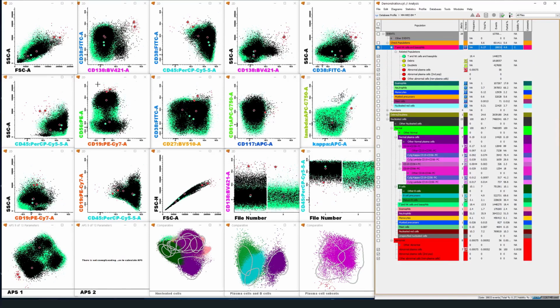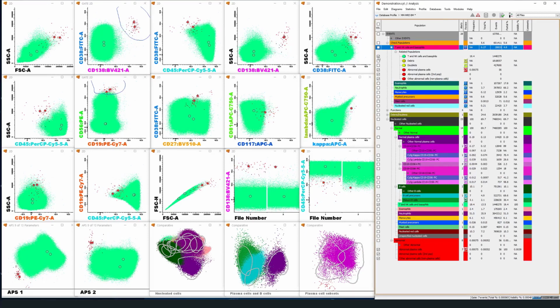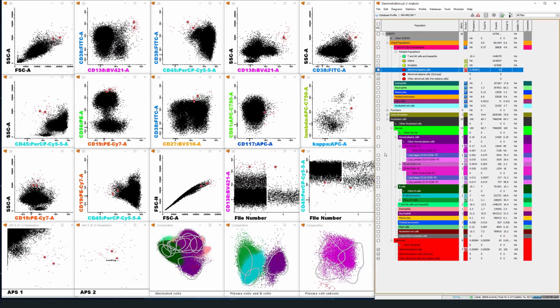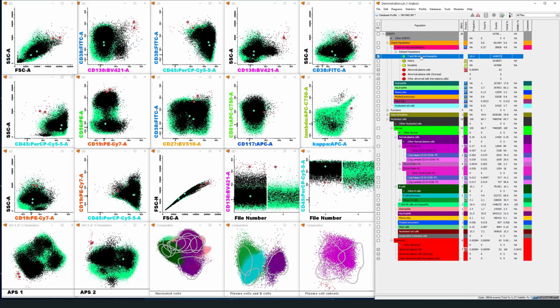And then I look through the rest of the populations, and sometimes of course CD56 may approach, if you have CD56 positive malignant plasma cells, abnormal plasma cells, they may be approached by NK cells in phenotype, but in this case it is possible that yes, some of them are lower side scatter aberrant plasma cells, but probably just a couple of them. I'll assign them to abnormal plasma cells, and the rest I will leave to be NK cells and basophils, which are not separated out in analysis, but well, this could be removed as debris, but it appears as it also could be maybe basophils, but they are a bit too low side scatter and forward scatter for that. In any case, I'll assign the whole population.